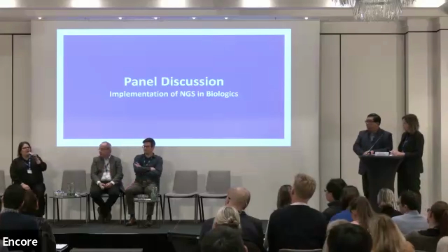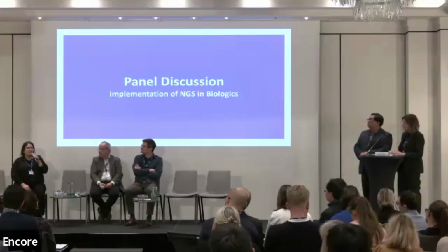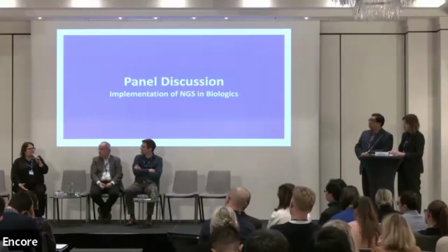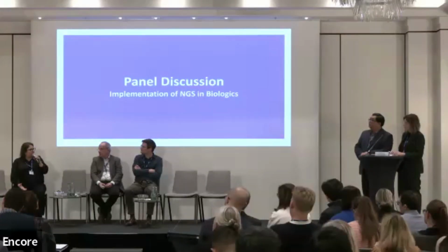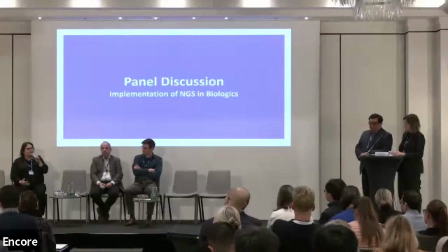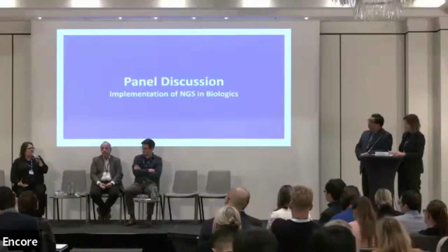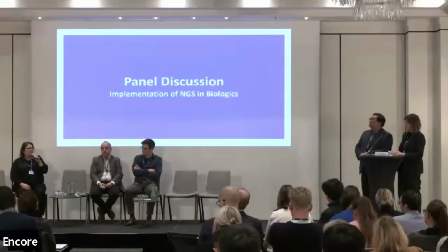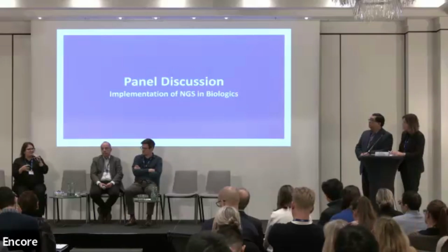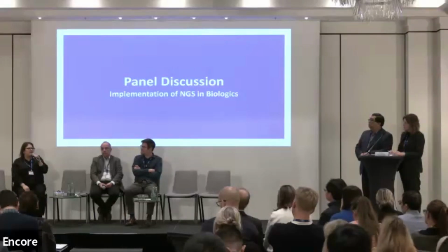Thank you. Yeah, so I believe, because Hive has so many wonderful tools in it, we'll still continue to probably use it in research space, right? What we're trying to do is move forward with an internal application, really for GMP purposes. So we have to have that sort of non-GMP in order to perform these kinds of studies.